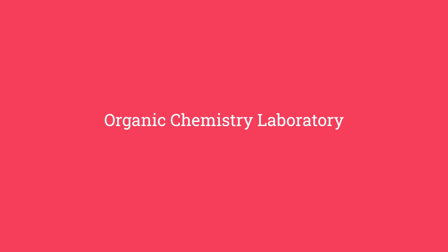I'm head of the Institute of Applied Chemistry. I'm also leading the bachelor and the master program here in the area of chemistry. I'm very happy to show you what we have.